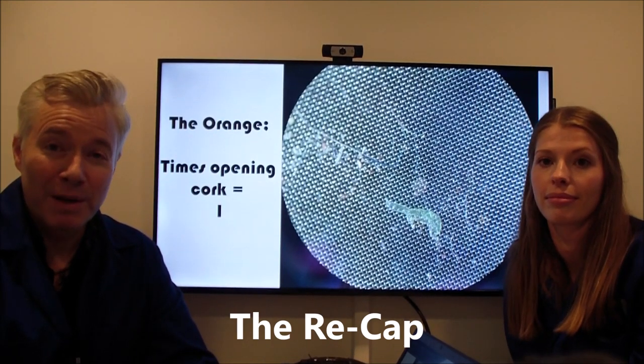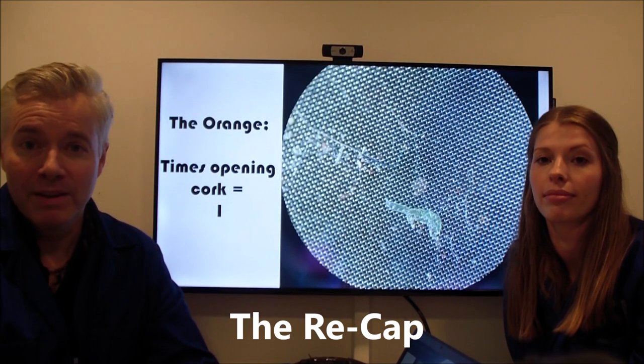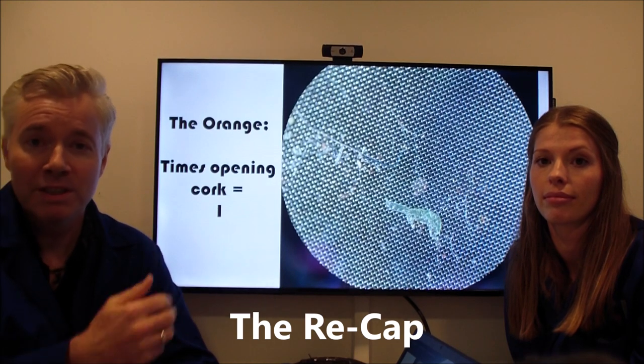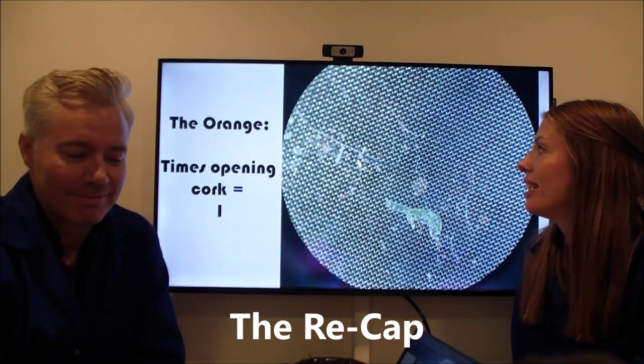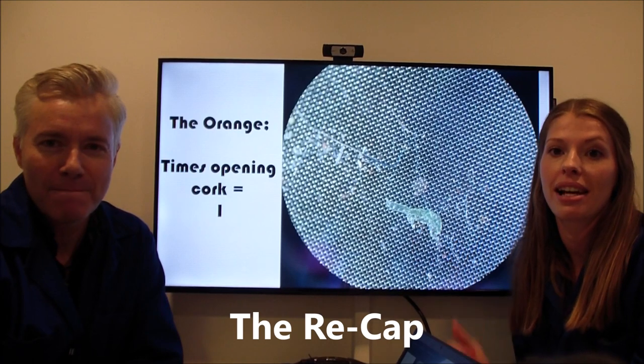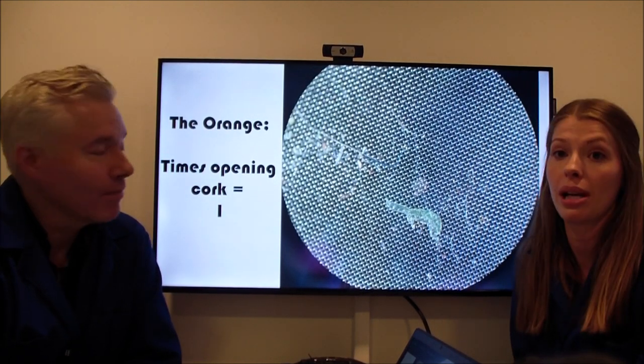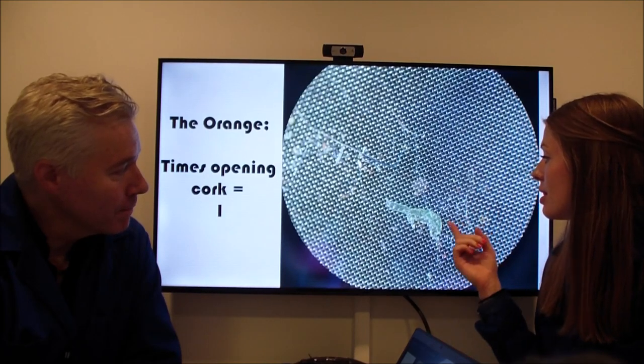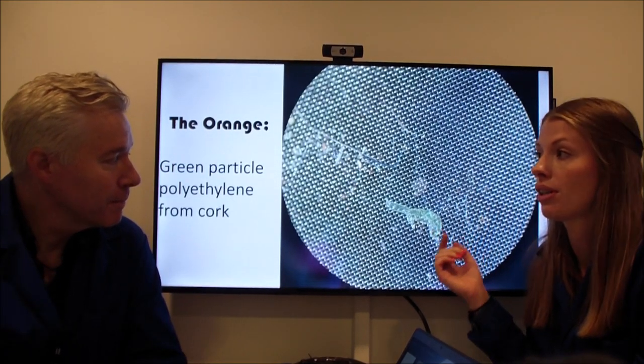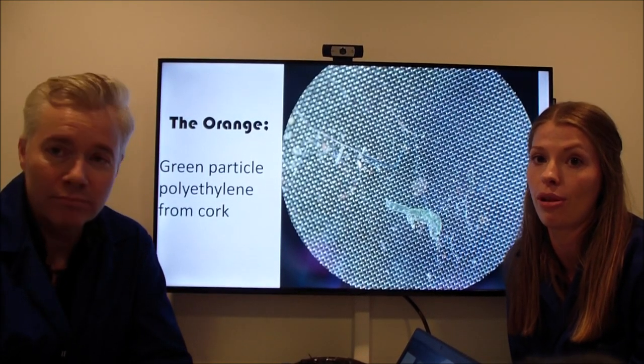Okay, so now we looked at our filter samples with the microscope and the FTIR microscope, and we'll just give you a brief summary of what we found. So this is the orange sample, which we didn't do anything with, but anyway we found plastics in it. For instance, this green polyethylene particle which is probably originating from the cork.